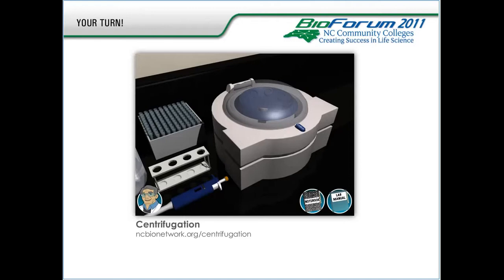The presentation also reinforces sound laboratory practices, such as the use of a lab notebook. As you work through the exercise, you'll be prompted to record your observations in the lab notebook. After completing the virtual lab work, you will be quizzed on your knowledge of the concepts and processes of centrifugation. After completing the quiz, you will be prompted to print out a certificate of completion. In a classroom scenario, students would be asked to complete the interactive e-learning tool before coming to the lab and to print out the certificate for presentation to the instructor. Our desire here is to enhance classroom and laboratory work by giving students a base of knowledge before coming in, ultimately allowing students to have more hands-on time.